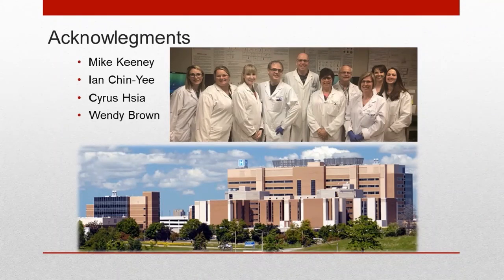How are the analysis templates provided? And somewhat related to that, what analysis software did you use in this study? The analysis templates were provided by Beckman Coulter, and I believe they're downloadable when you have the product. They use Kaluza, which is obviously Beckman Coulter's proprietary software. They use a different version now called Kaluza C, which is very similar to the research Kaluza that has been around for a number of years that many people use.